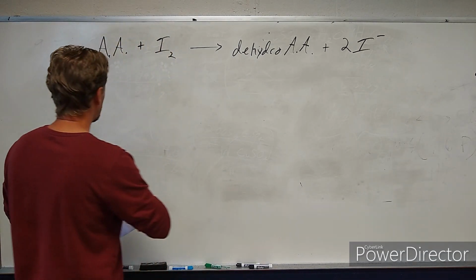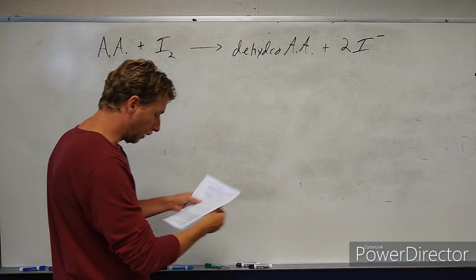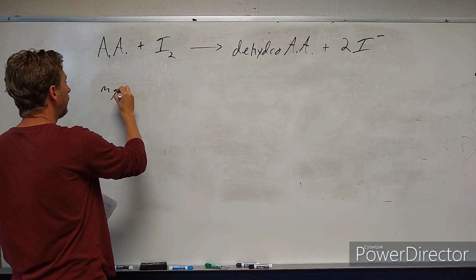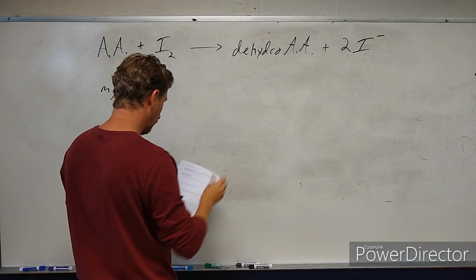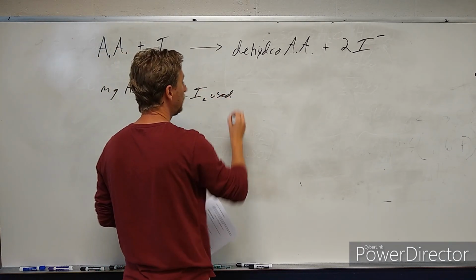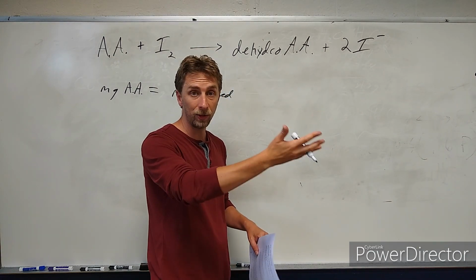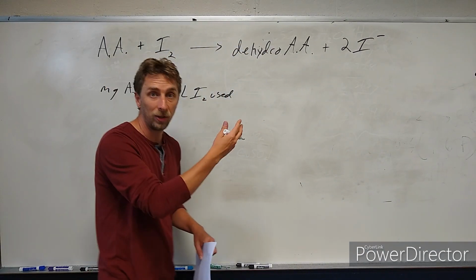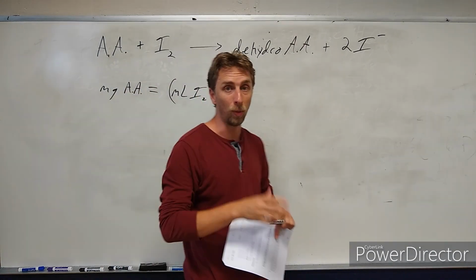So if we want to know how many milligrams of ascorbic acid are there, well, the formula down here on the bottom says this right here. Milligrams of ascorbic acid is going to be equal to the milliliters of iodine used, that's in the titration that we're going to set up with the burette and the volumetric flask and this stir bar and everything. How many milliliters of iodine was used to reach the end point? And so that's a key idea, is the end point.